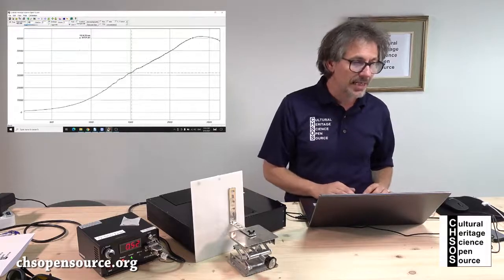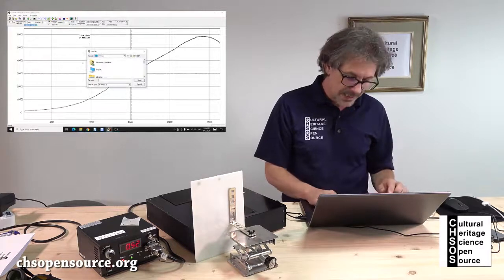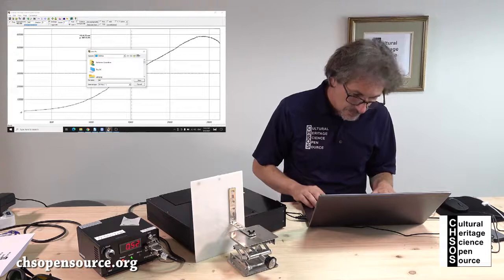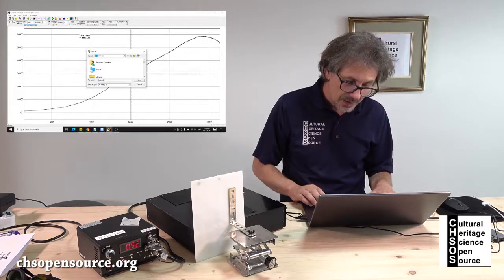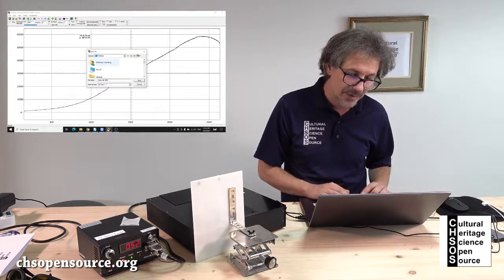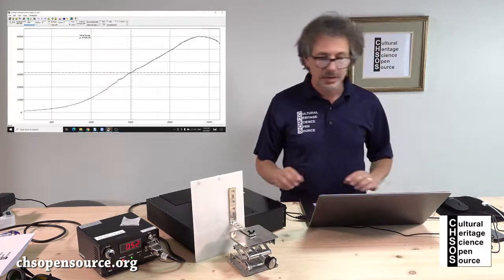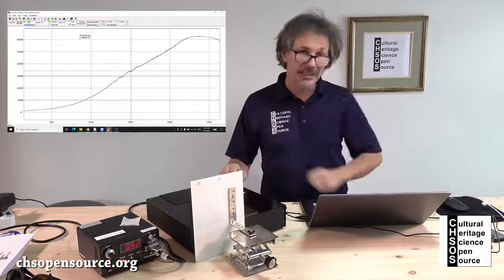So what I do is, first of all, I save this spectrum. So file name, we name it slit open, actually open slit, and the acquisition was 400 milliseconds, so that's the name I want to give to this spectrum. Okay, and now we do the same experiment, actually closing the slit all the way.